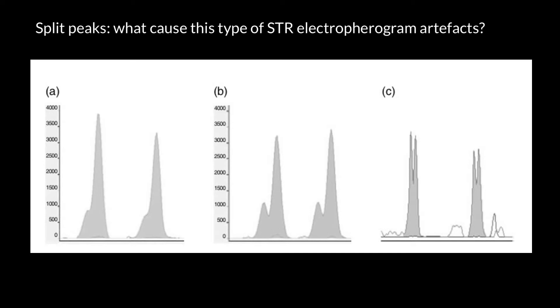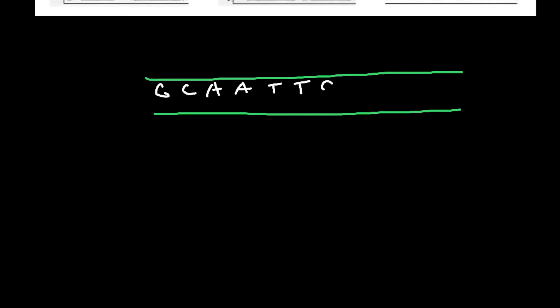Let me draw a picture. Imagine we have double-stranded DNA. The sequence of the top strand is going to be: guanine, cytosine, adenine, adenine, thymine, thymine, cytosine, thymine, adenine, cytosine, cytosine, and guanine.